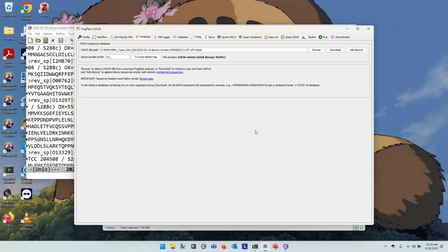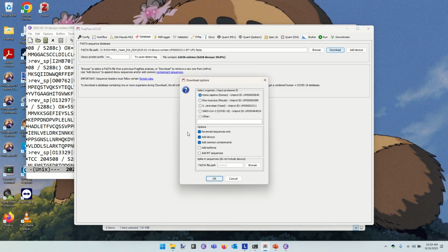Now you might say that sounds like an awful lot of crazy manipulation to make all that work. And helpfully, you can actually do a lot of this work in the graphical user interface. You can see it already has pre-baked sort of the most common reference genomes that you could grab, but you can specify your own on the command line if you're working in a species that it doesn't have listed there, and that's fine. Typically, I tell it to include reviewed and unreviewed sequences. I am probably the lone voice in the wilderness who feels that way. But if you want to ensure that every protein coding gene of a species is included in the sequence database, you need to turn off reviewed sequences only.